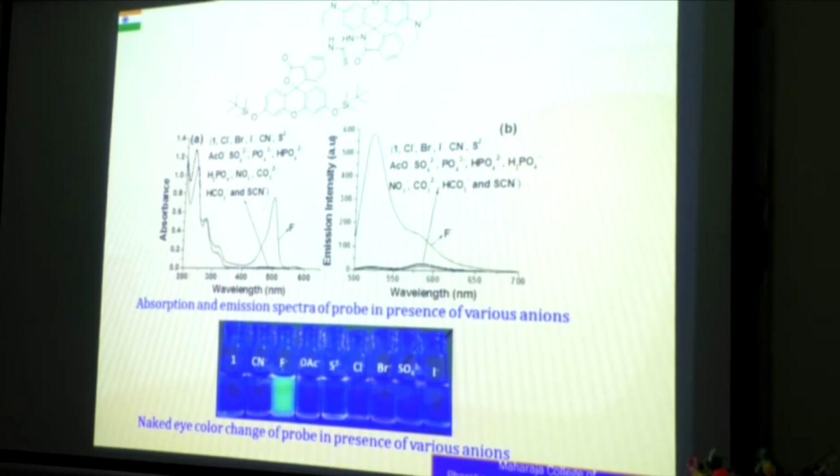Then what we did, as you do regularly with your pharmaceutical analysis, was validation of the technique and determining the limit of quantification, limit of detection, all kinds of things, which we also did. And then, next slide.